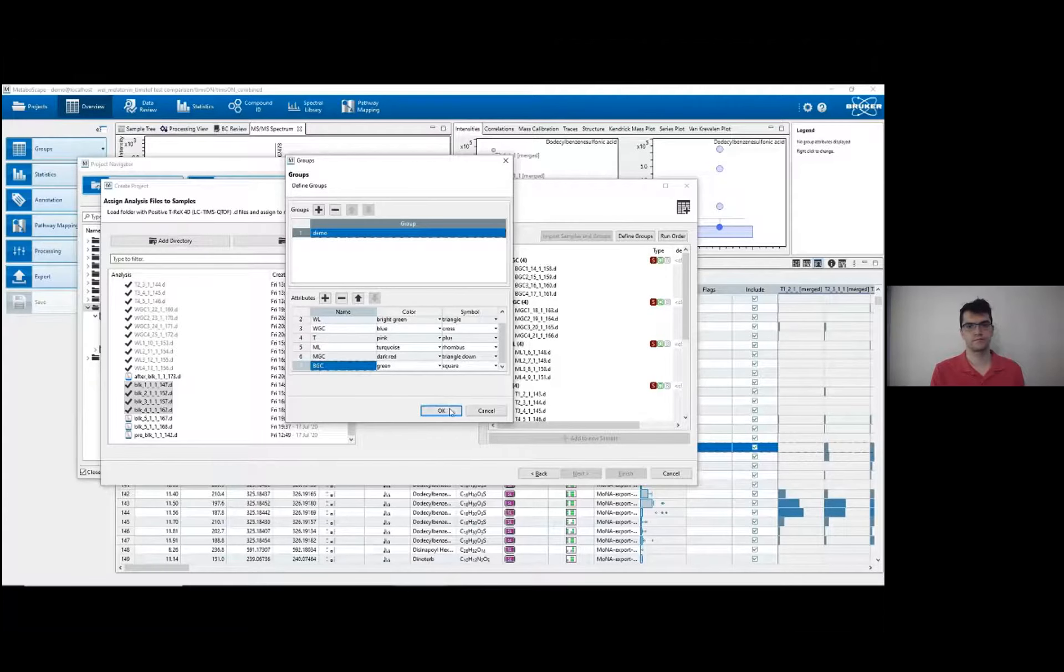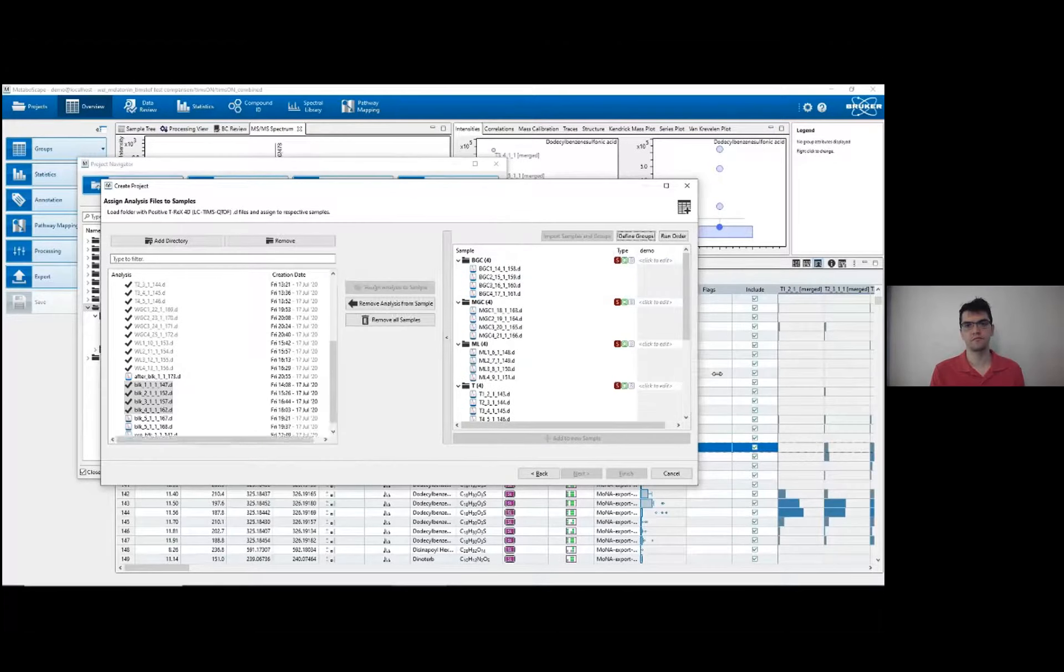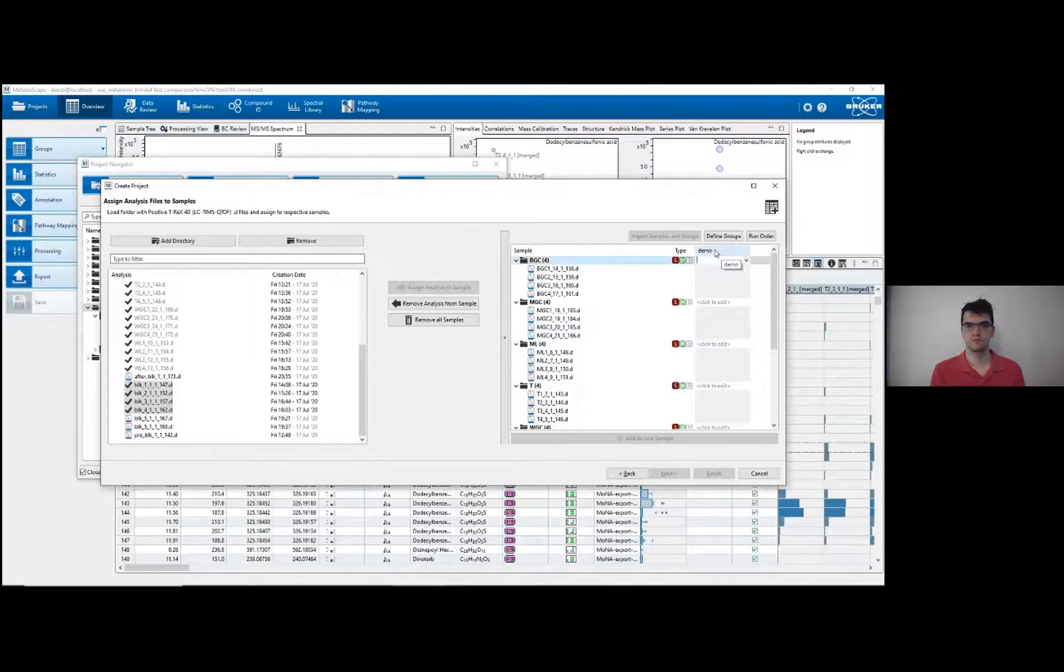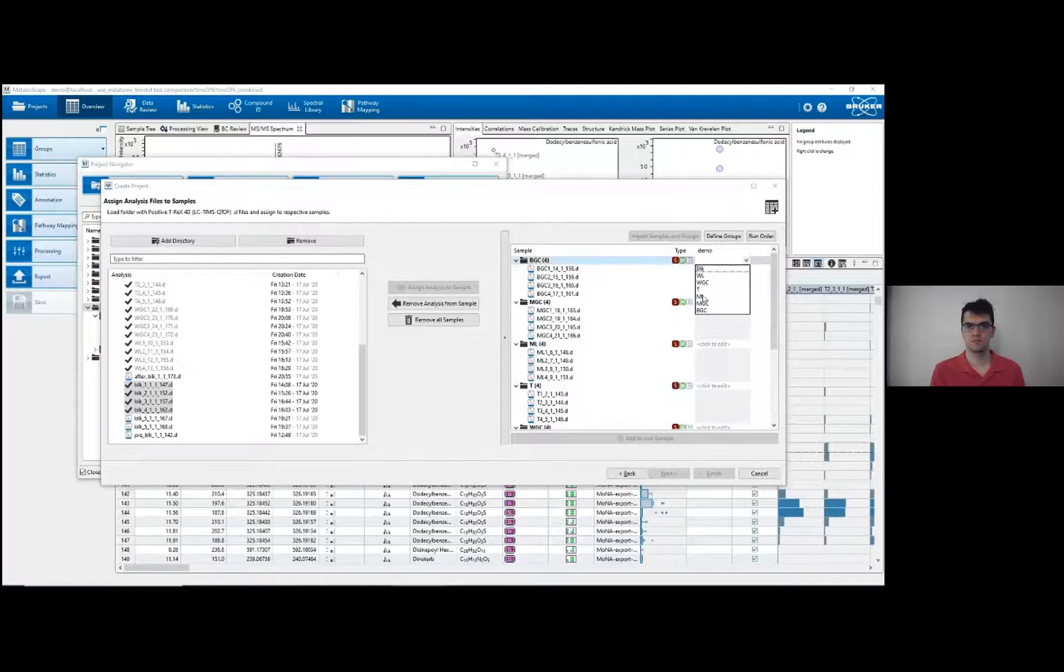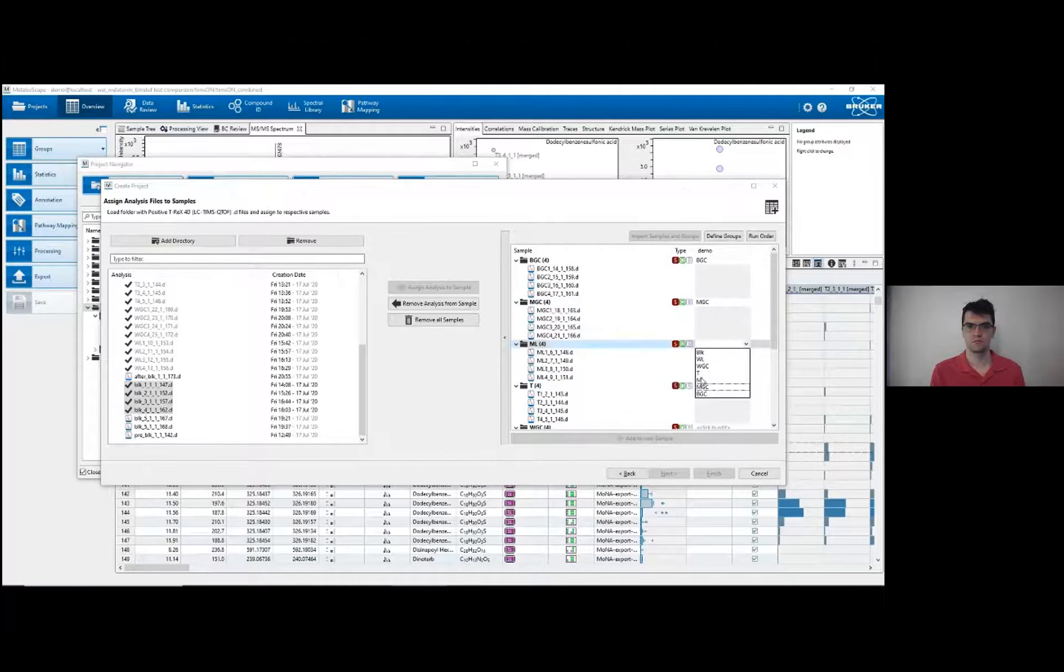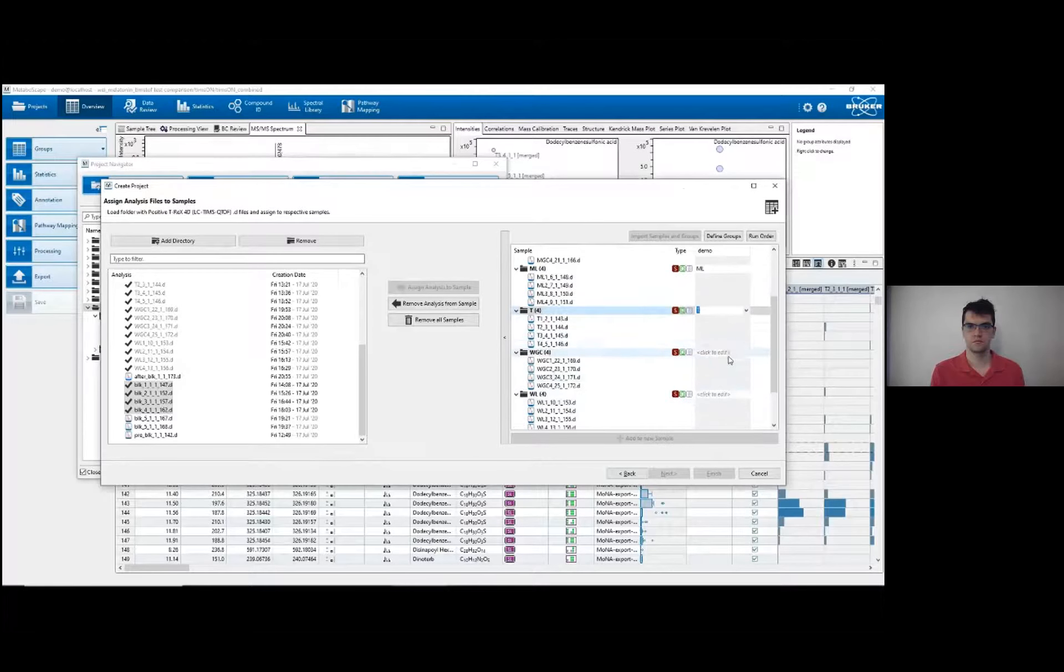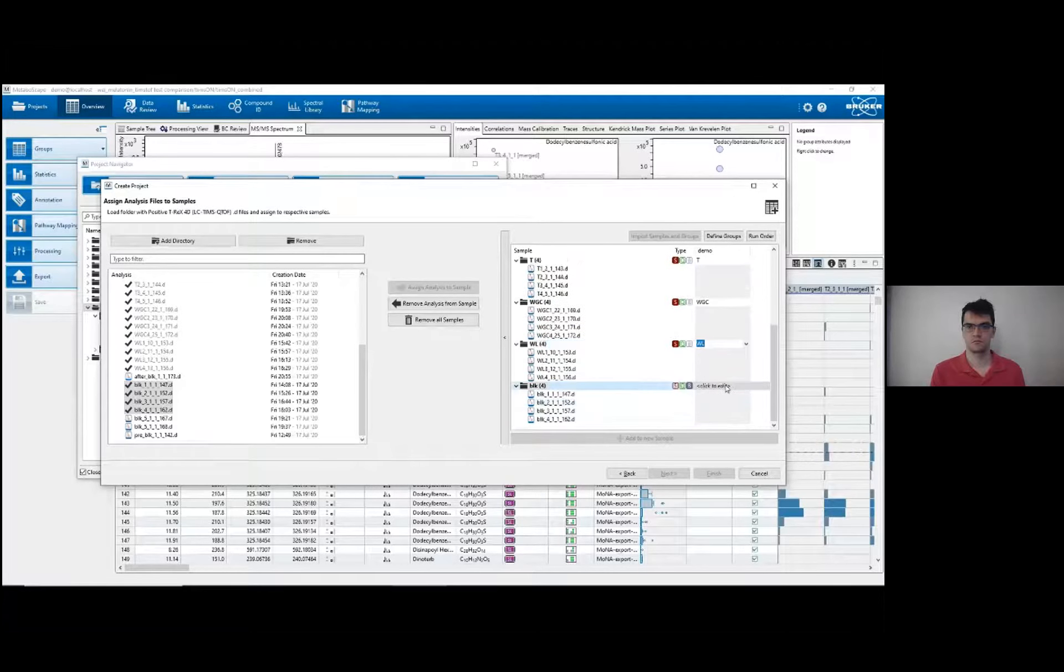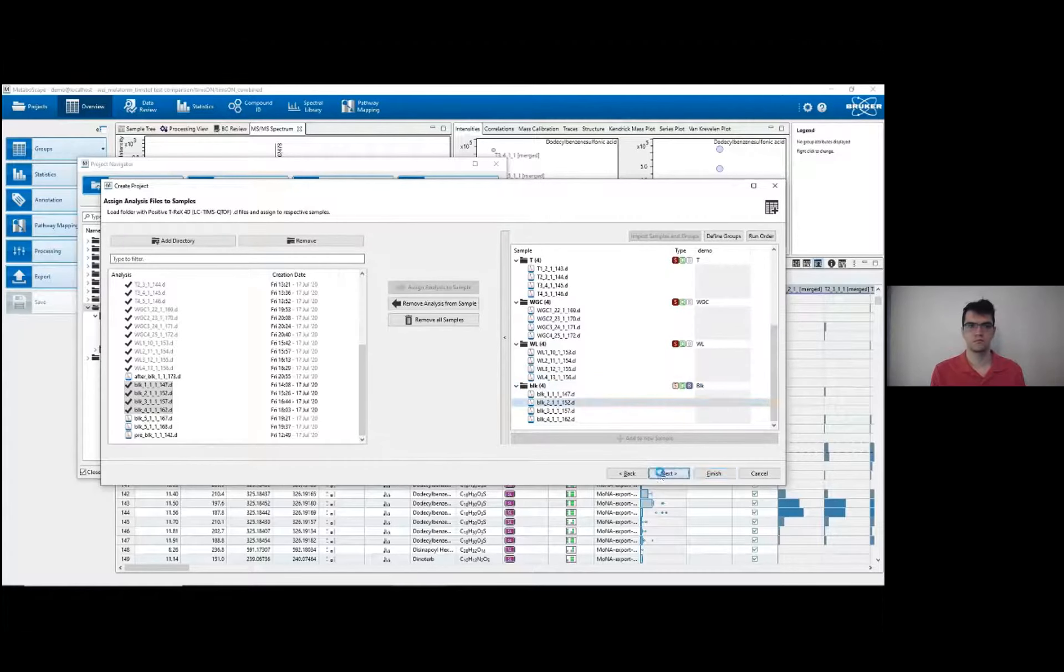Okay, now that the groups are defined, I have to add the type of group to each sample. So you can see the sample name, the group name here, demo, and then each attribute is listed in this drop-down table. So I'll go BGC, MGC, ML, and so forth for all of these. Okay, I can go next.